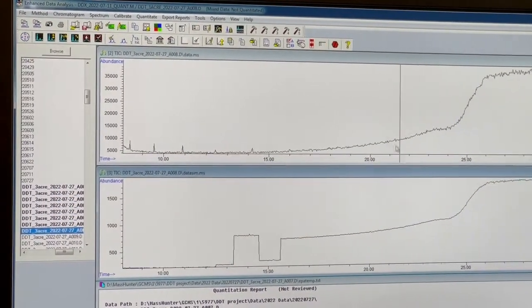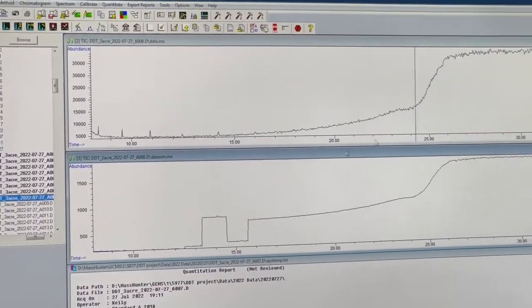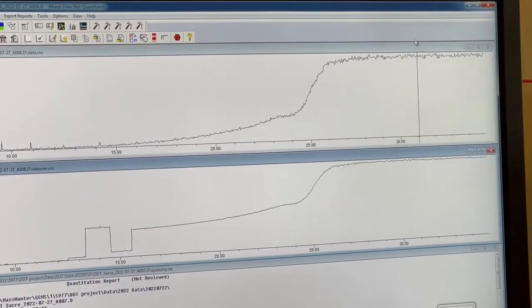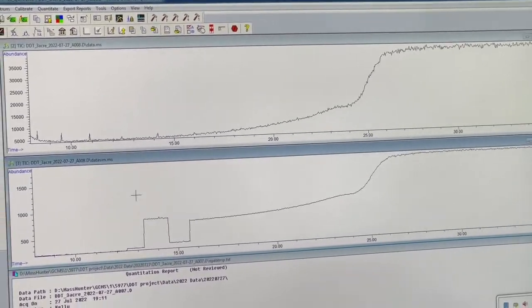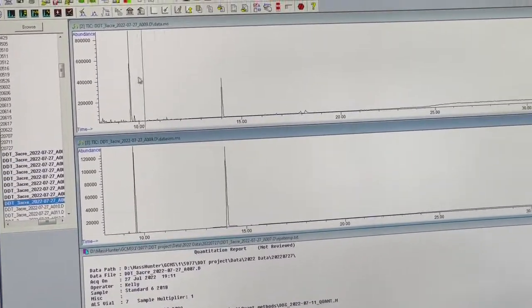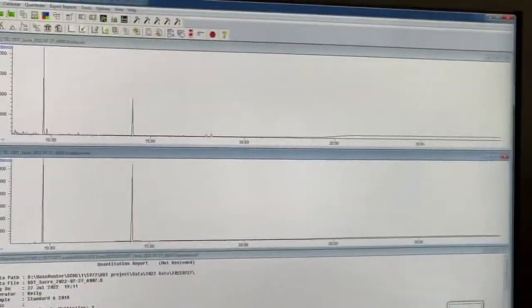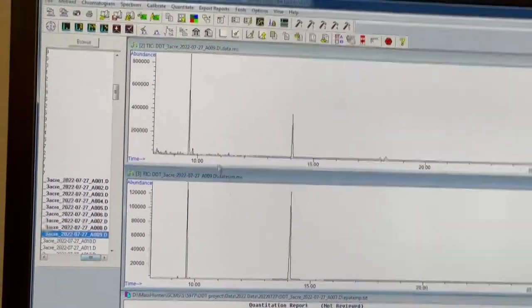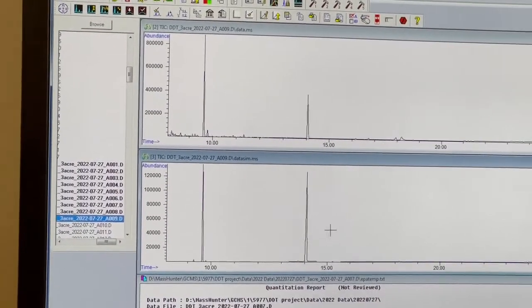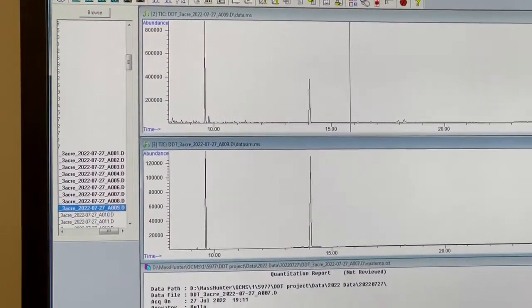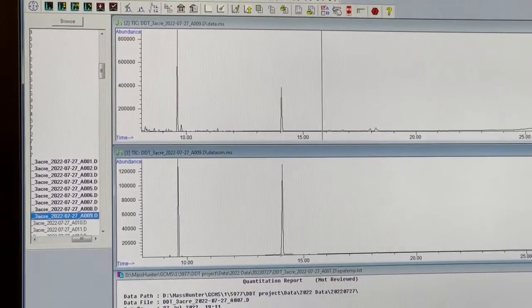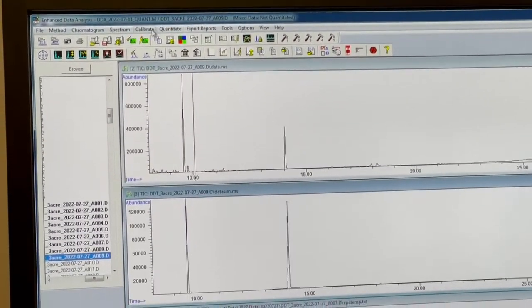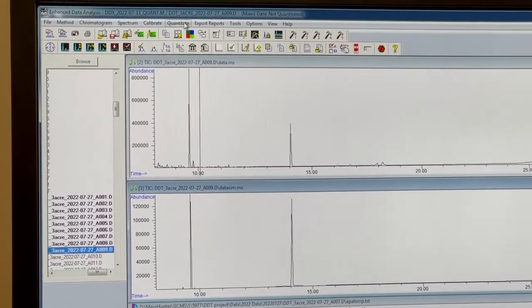This is our hexane blank. This looks fine. It didn't have that peak from earlier, so that's good to see. After this, this is our sampling. You can see two peaks. That's what we're looking for.